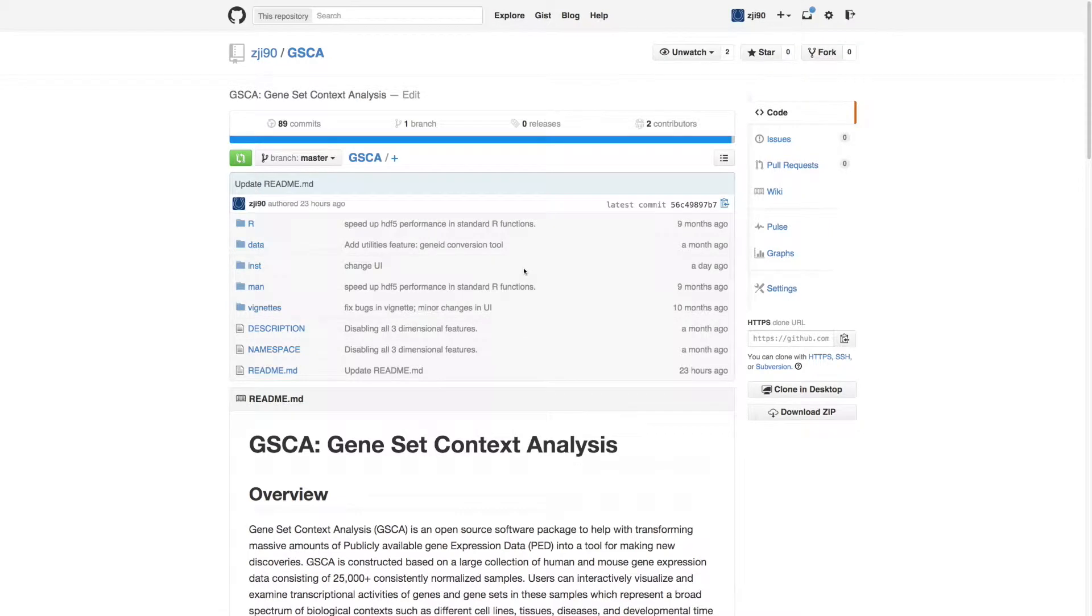Hi, this is a short demonstration of Gene Set Context Analysis User Interface. A complete installation guide is on GitHub.